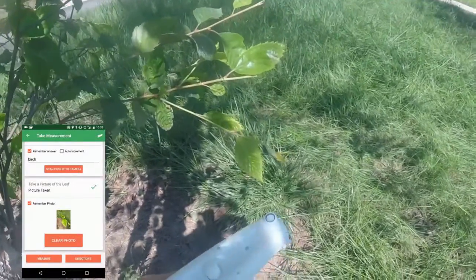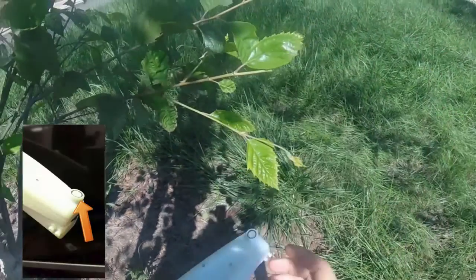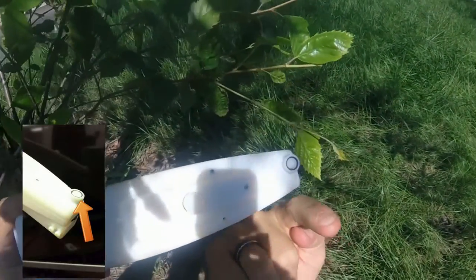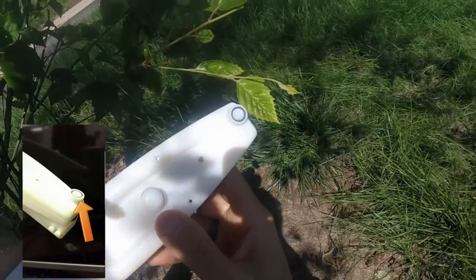1. Position yourself so you're not shadowing the sample or light sensor. The white circle is the light intensity sensor. It should be facing upwards and the sensor should experience the same ambient light level as the leaf in its natural position.